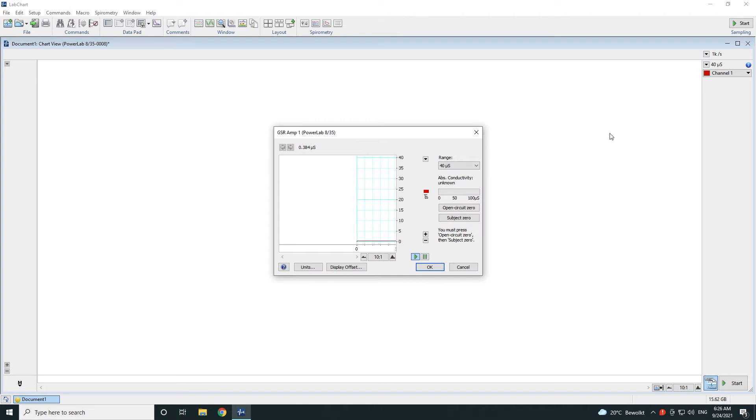In this dialog you can set up the range of the input signal, but for zeroing it can be left on 40 µS.